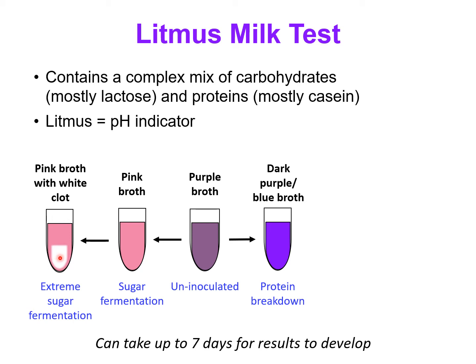Now, does that mean I must get curd if I left it longer in the incubator? No, that's not always the case. Again, at the end of the day, it depends on what type of bacteria you have. Some bacteria are just going to go through sugar fermentation and that's it.